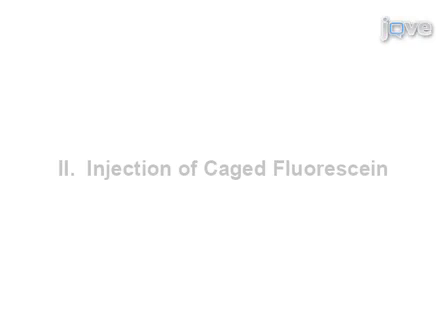The main advantage of this technique over existing methods such as confocal microscopy or flash lamp is that it allows photoactivation of relatively deep tissues at axial level of a few microns with relatively low phototoxicity. The method presented here is used for cell lineage tracing. It can be applied for photoactivation of a variety of compounds, allowing targeted control over developmental and physiological processes.